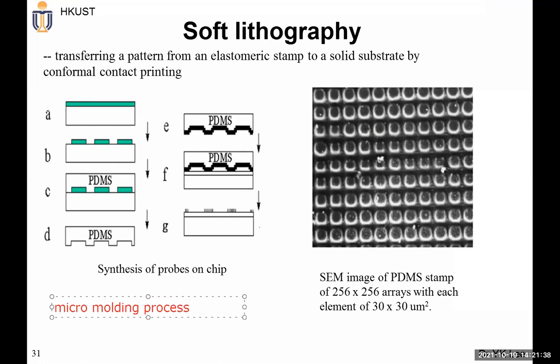process. That means from the silicon wafer, you do deposition in one layer, and then you do patterning on the wafer, and then you pour the PDMS. PDMS is a special kind of liquid polymer, and after a certain time you add some curing agent, and it solidifies from liquid into a solid form. This is a way that people make a long list of different kinds of microfluidic devices without very complicated fabrication processes.